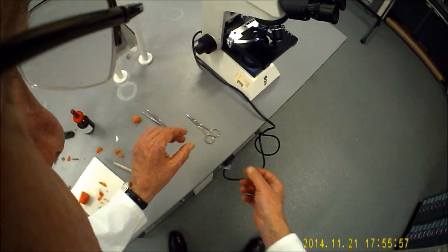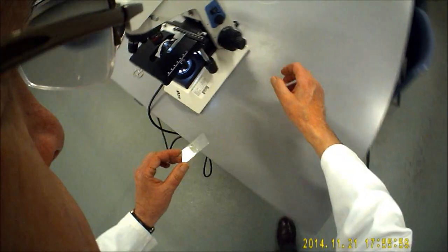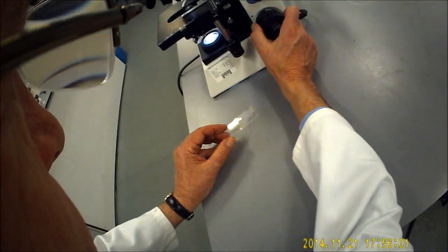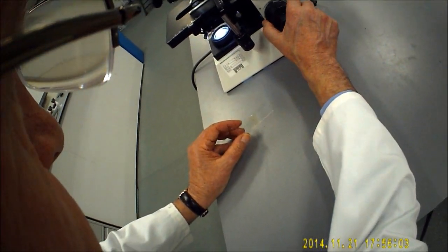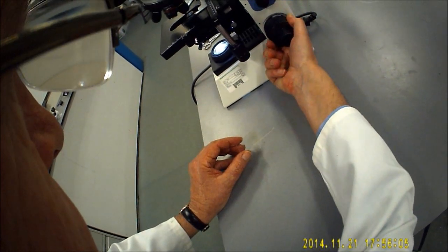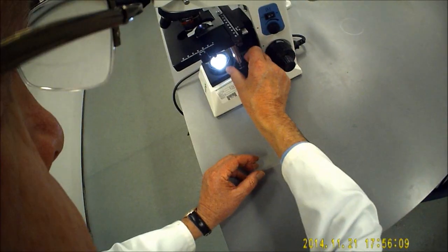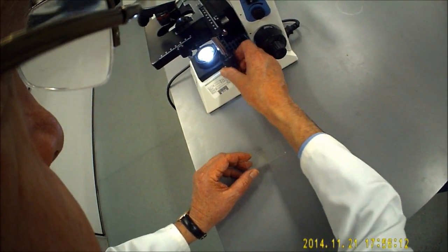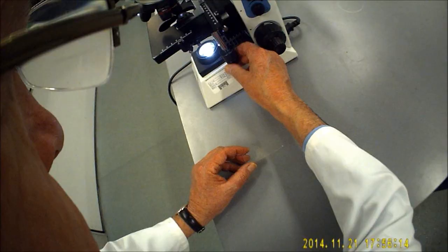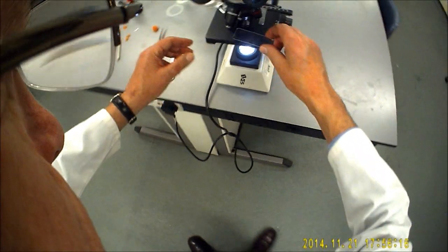So here's our microscope. First thing I need to do is to make sure that the stage is as close as possible to the lens, and then we track away from that when we're focusing. We've got our movable stage, so we'll get that centralized.